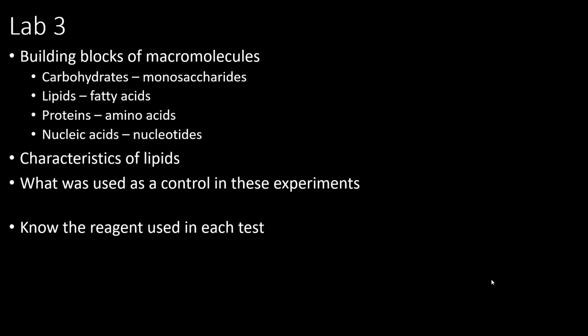So they are not going to dissolve or be soluble in water. Now, in these experiments that you read about, and you actually performed one in lab number 3, there was a control that was used in the experiment. And this control is the one who gave you a negative test no matter if you were testing a carbohydrate, lipid, protein, or nucleic acid, because it does not contain any of these things. This control is water. Water is one of the best controls to use here.